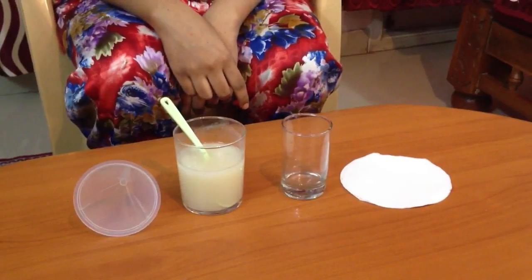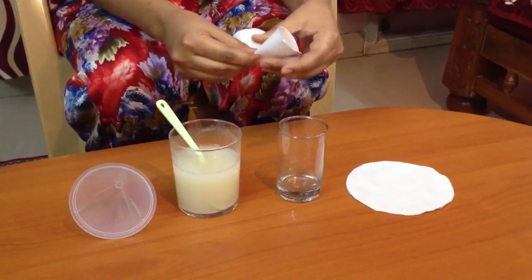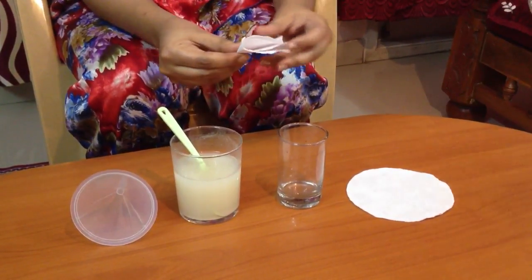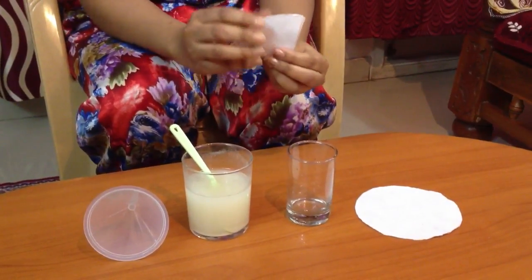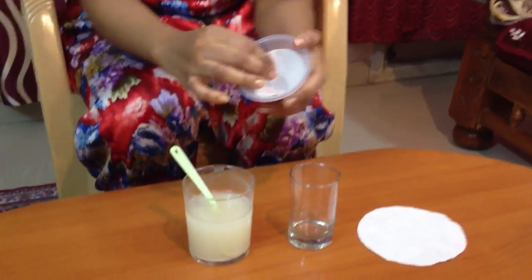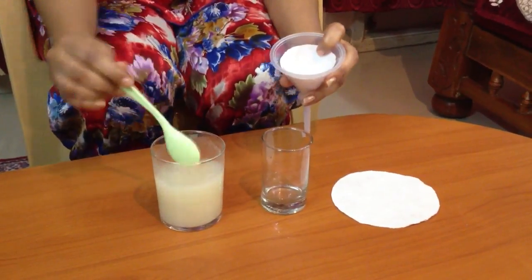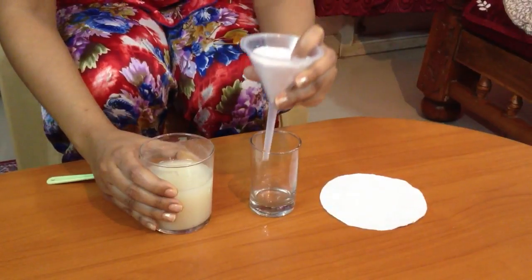We shall fold the filter paper in the form of a cone and fix it on the funnel. Then pour the mixture of wheat flour and water on the filter paper.